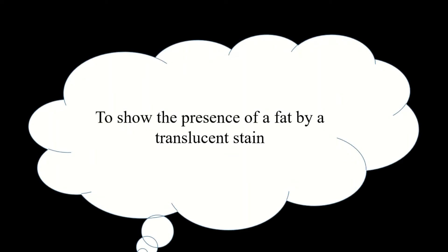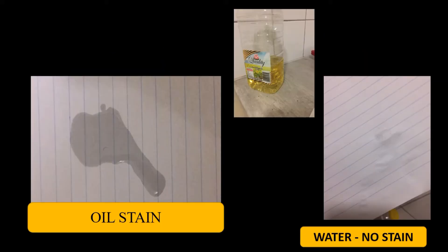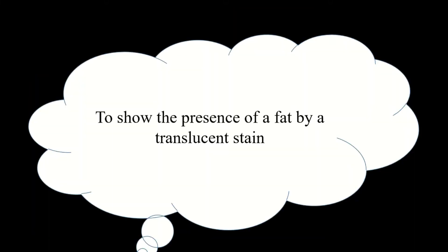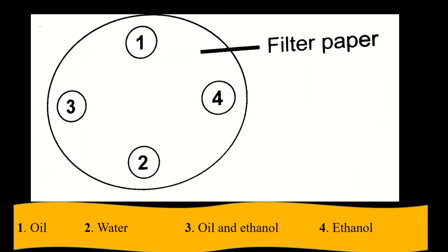We want to show the presence of fat by a translucent stain. We have seen what happens when you accidentally pour cooking oil on your clothes or on a piece of paper — there's always a stain that remains behind. That is what we want to demonstrate at the end of the day.